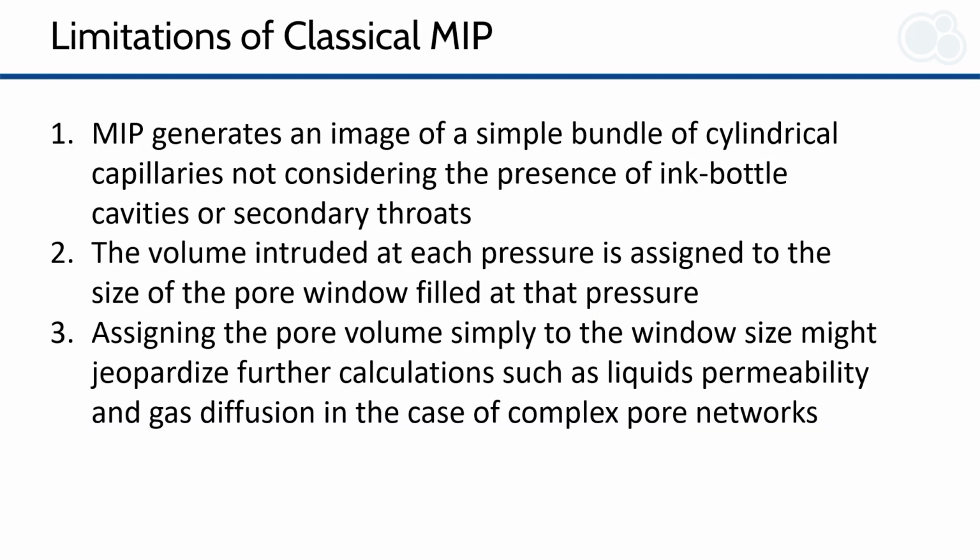When we speak of pores being filled through windows or throats, we generally interpret the pore structure as a bundle of parallel cylindrical capillaries. We see a certain volume filling through an opening of a size that can be calculated from the applied pressure. We don't know anything about whether the pores are interconnected or of some shape other than a cylinder, maybe that of an ink bottle. If we want to calculate liquid permeability or gas diffusion rates from these intrusion results, the values may be incorrect for complex pore structures.